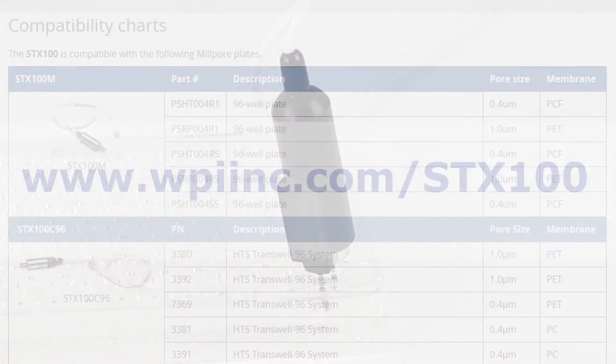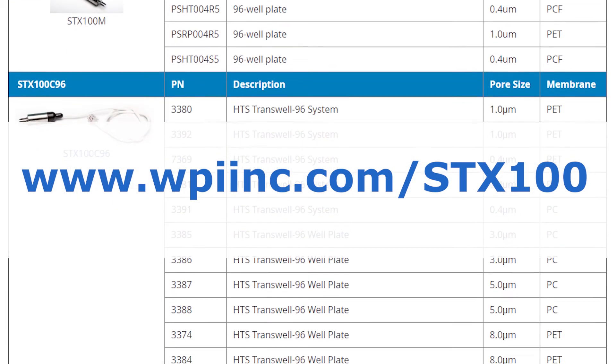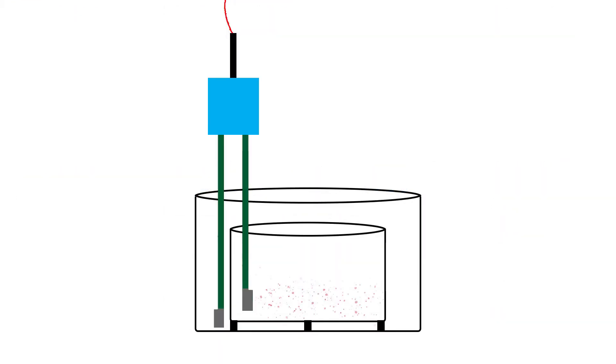Please refer to the STX100 compatibility chart on the WPI website. Using STX100 electrodes we can record resistance measurements inside a well plate. If you are concerned that your cells are loosely attached to the cell culture inserts and may get dislodged, STX100 electrodes may be a suitable choice for you.